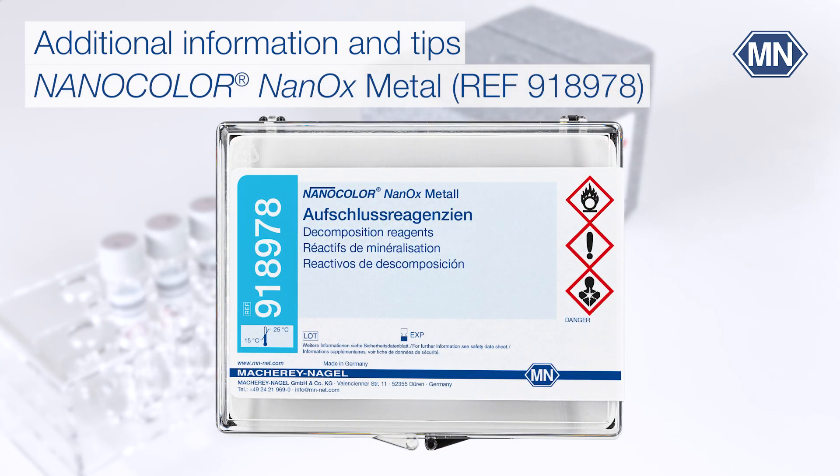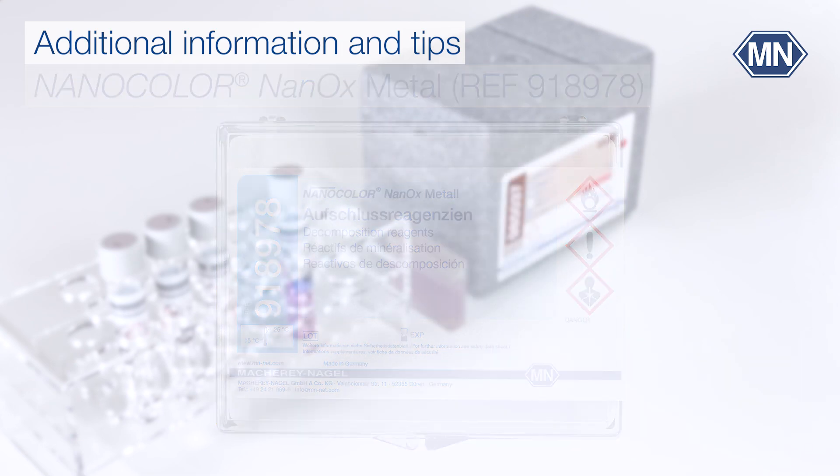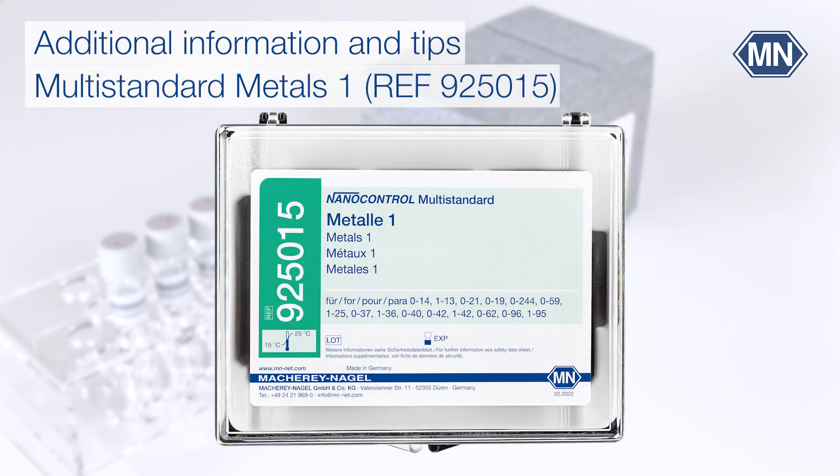The test kit only determines dissolved iron compounds. A decomposition with Nanocolor Nanox Metal is mandatory for the determination of total iron content. We recommend using our multi-standard Metals 1 for internal quality control purposes.